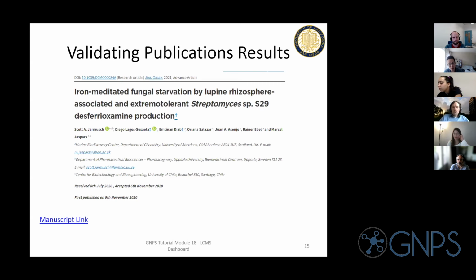That very initial load might take, depending on your file, anywhere from a few seconds to a few minutes. This really comes into play during large proteomics runs, like a 2-hour run with 100,000 MS2 scans. That might take a few minutes to convert.